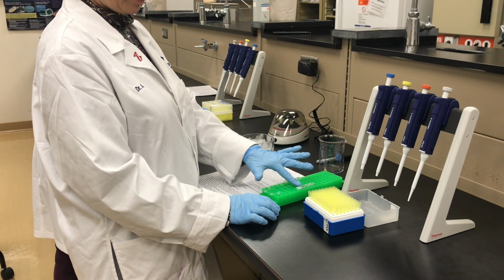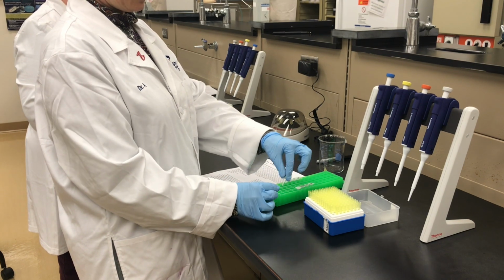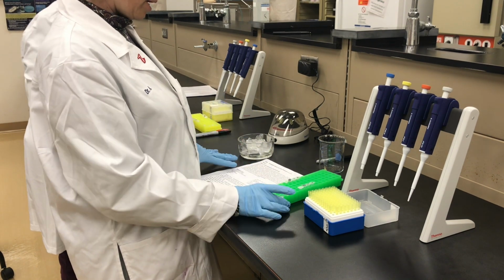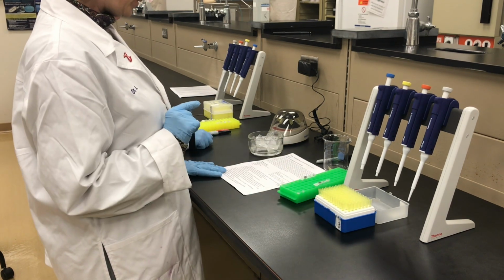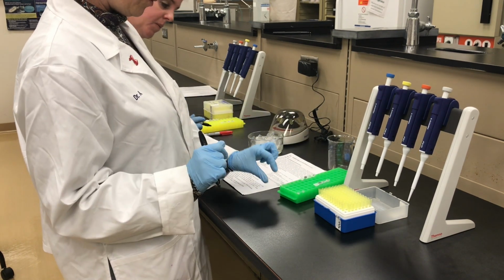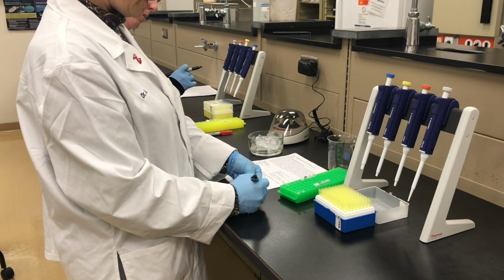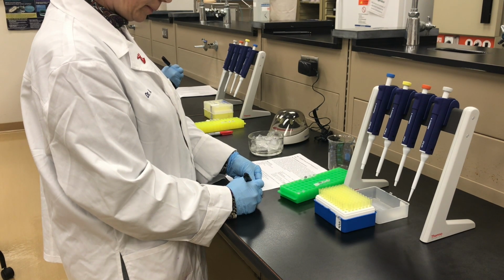Okay, each group, if you were here, would have half of this rack and be setting 2 PCR reactions. Dr. Cheney and I are going to set up 4 sets of reactions for the video. So, I think we're ready to start. Oh, we have to label first. Tiny PCR tube with the white ball in it. The white ball has the polymerase and other good stuff for this chemical reaction. So with the white ball in it, it's number 1.